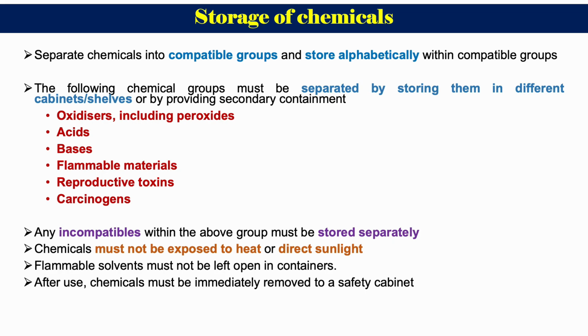Chemicals must not be exposed to heat or direct sunlight. Flammable solvents must not be left open in containers. And after use of each and every chemical, it must be immediately returned to safe storage.